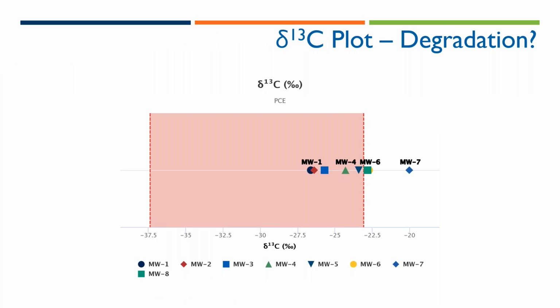And then we come to some of our first plots of the actual data that came from the isotopic analysis. So this, for example, is a 13C plot for PCE that was run through our lab. And what we're looking at here is a number of things. So first of all, we have each of these samples, which are provided in different colors and shapes so that we can easily differentiate them. But just as Kate mentioned, when we're sampling, and this applies to CSIA as well, we want to sample down the center line of a plume. So what we're seeing here is as groundwater was pulled from either the beginning of the plume or near the tail end of the plume, we're seeing that these delta values have increased, which shows that degradation is occurring.